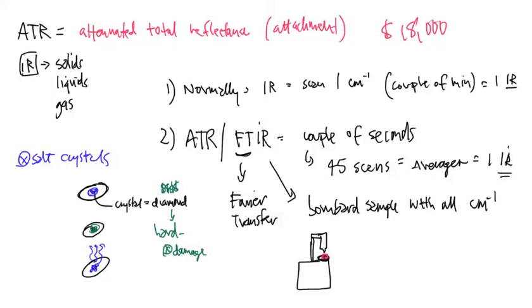And what would happen is that if I wanted to, I can take this lever and crank it down, and this lowers the anchor down onto the plate, and it prevents that from escaping underneath. So in other words, it makes a very tight seal. It puts a little bit of pressure onto the top of the cap, and it holds it down onto the plate so that sample cannot go anywhere.